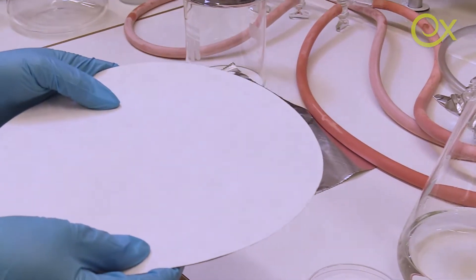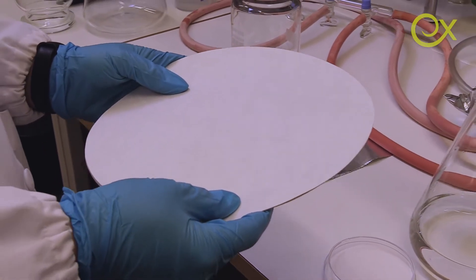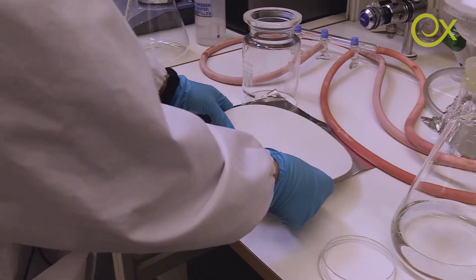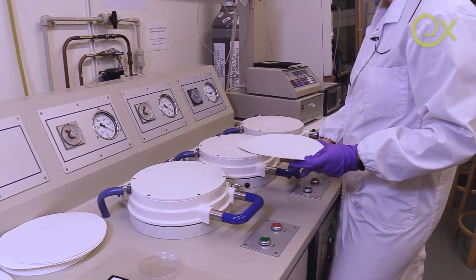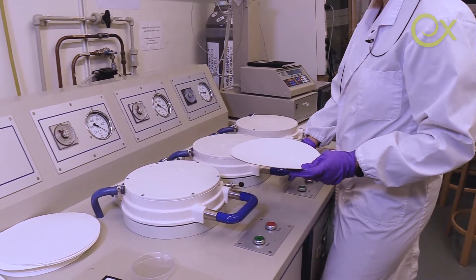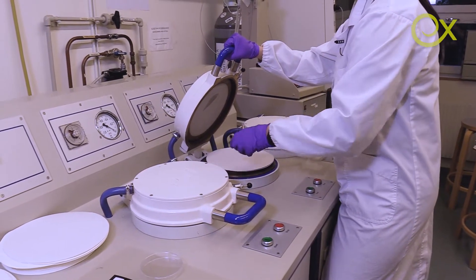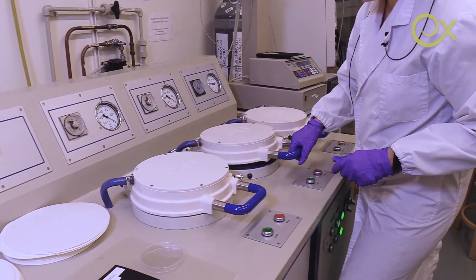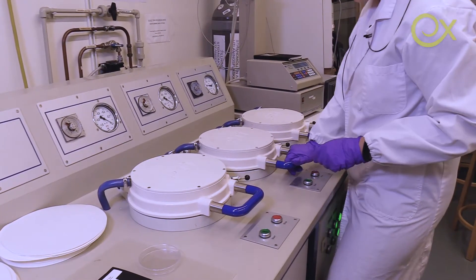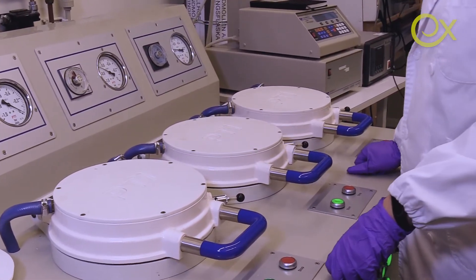Now we are ready to go to the rapid Köthen equipment where we will dry the MFC paper. It's time to dry our MFC paper or nanopaper. The temperature is 93 degrees Celsius. I'm placing the gel cake inside the equipment and starting up. The drying will take 15 minutes.